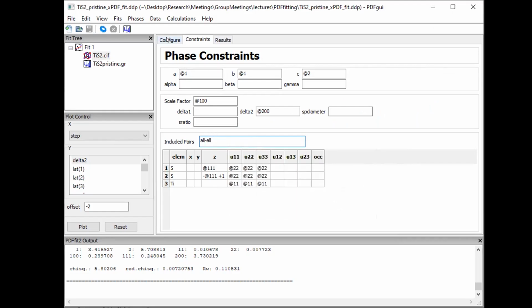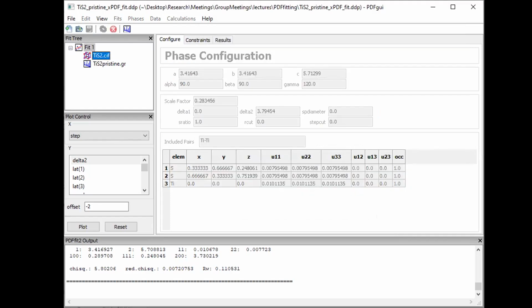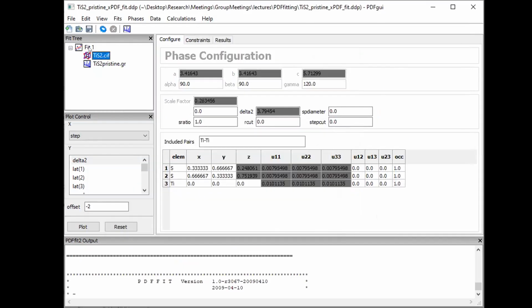Oops, sorry. I should put it here. Okay, press enter, and we run it. Oops, there's some, we just do it again, okay.